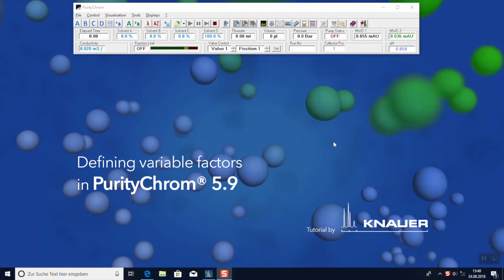Our new version of PurityChrom 5.9 offers updates along with new powerful features. In this video, I want to introduce our new feature of defining variable factors for certain functions in a method. Those are called variables.